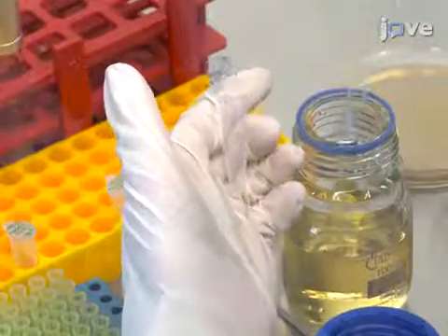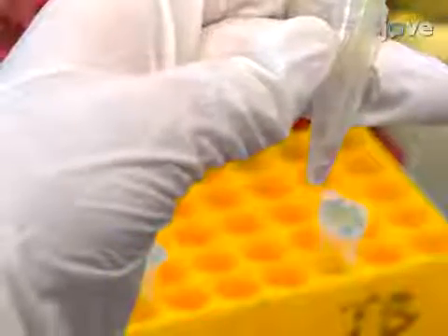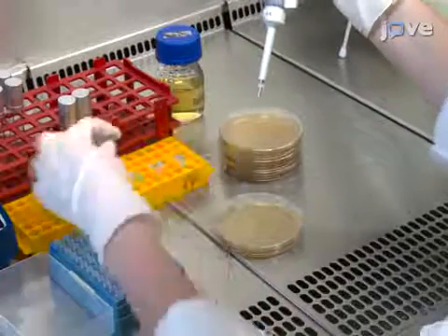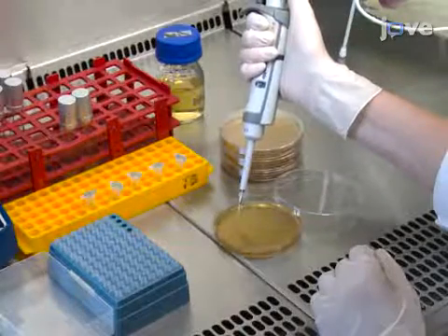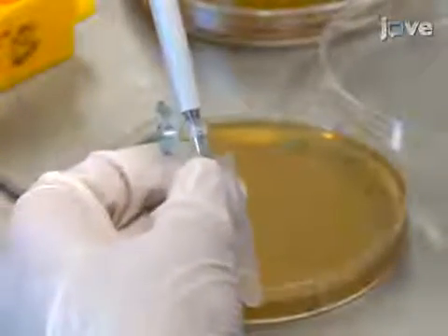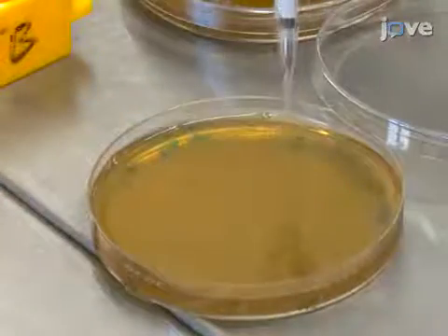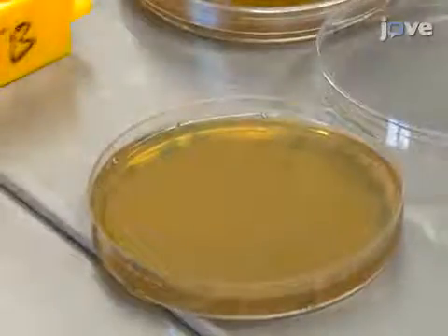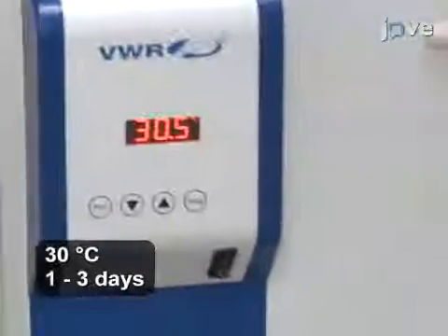Prepare tubes with 100 microliters of LB medium and, using the mixed culture, create a 10-fold dilution series of inoculates. Using a micropipette, spot 2 microliters of the non-diluted mixed culture onto the 2xSG agar plate. Repeat this with inoculates for the 10 to the 1, 10 to the 2, 10 to the 3, and 10 to the 4 dilutions, spacing spots at equal distances to allow 6 to 9 colonies to be grown on a single dish. Incubate the plates upright at 30 degrees Celsius for 1 to 3 days.